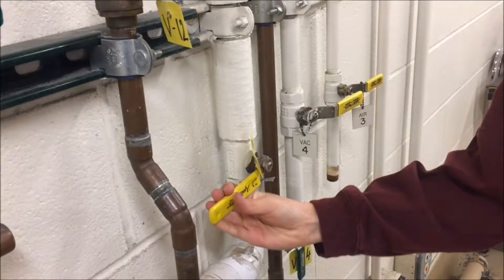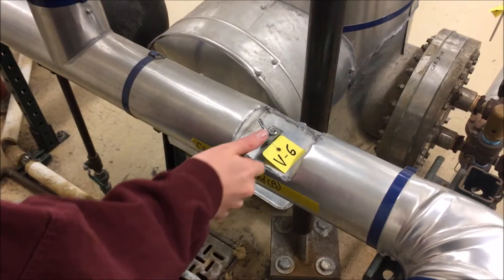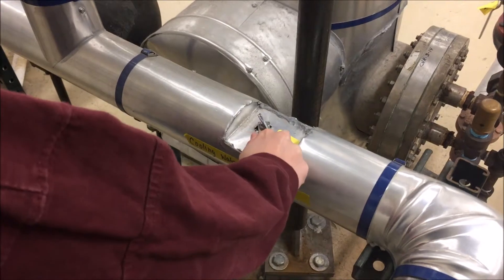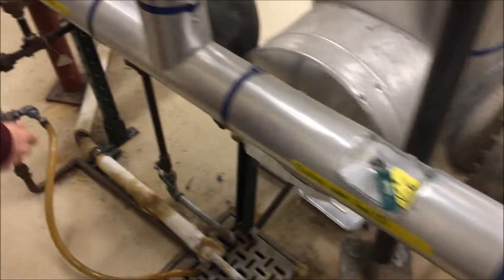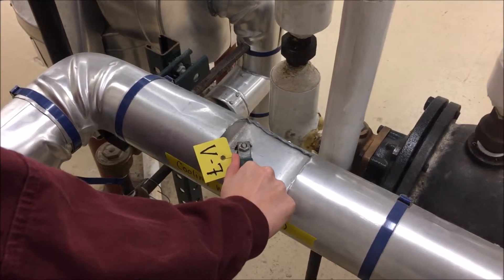Turn on the water supply by opening valve V15 on the back wall. Turn the cooling water on for heat exchanger 1 by opening valve V6 to 45 degrees, and for heat exchanger 2 by opening valve V7 to 45 degrees.